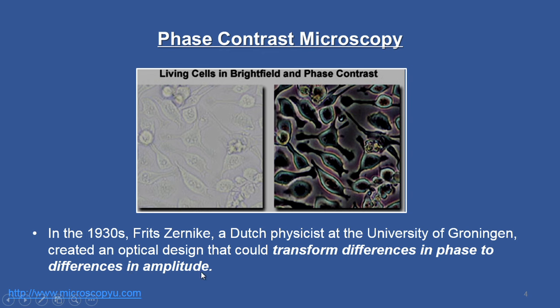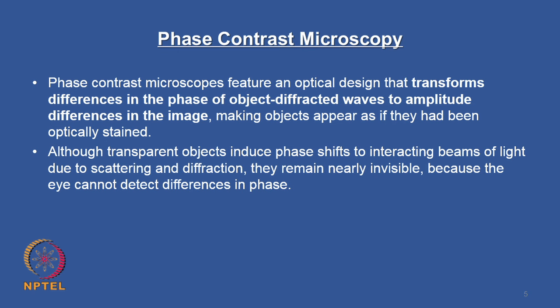I just mentioned that there will be a small change in the phase of the object. So the differences in the phase in the object are transformed to differences in the amplitude in the image, which will enhance the contrast. So we will now see that. Let us go through the introductory remarks.